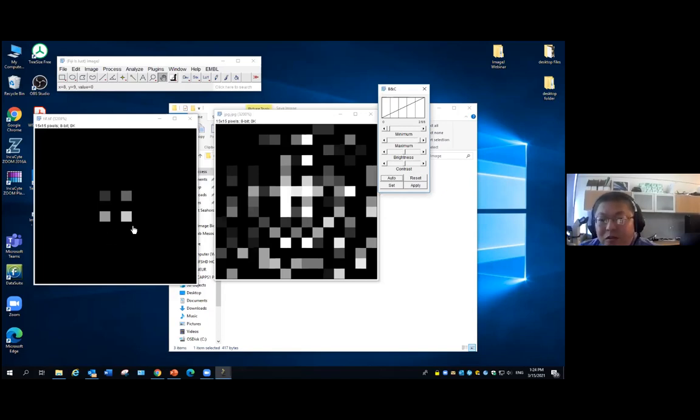So the point is, when you save the image as a JPEG, it does change the pixel intensity. That's how JPEG works. They adjust the pixel intensity through an algorithm to try to make the file size smaller. So as long as you still want to use the image for analysis, always save them as TIFF. Never save them as JPEG. I would say never ever.